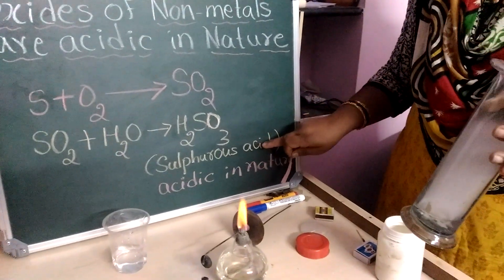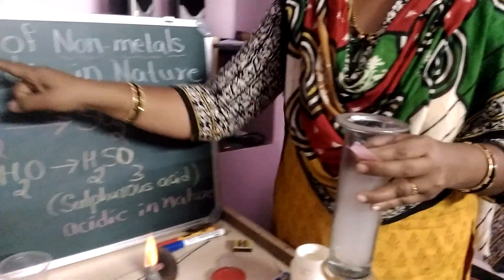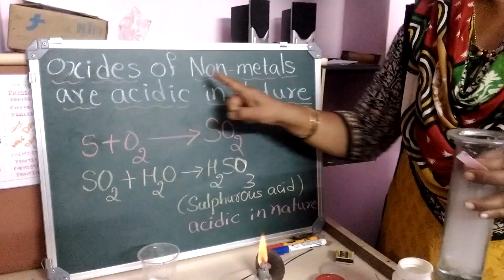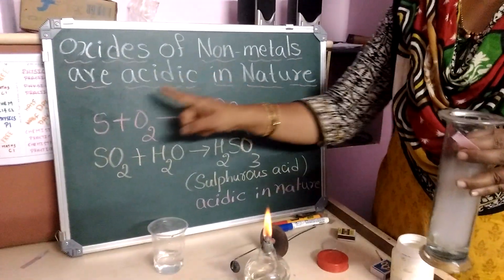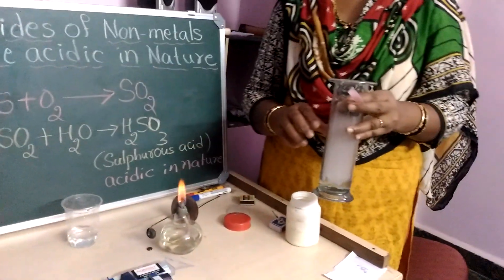Sulfur dioxide dissolved in water forms sulfurous acid, which is acidic in nature. So we can conclude that oxides of non-metals are acidic in nature. Thank you.